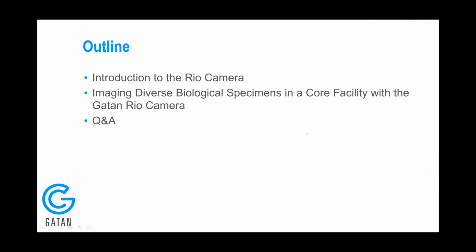Here is the outline for our webinar today. First, I will give you an introduction to the Rio camera, our newest CMOS camera from Gatan. Then our invited speaker, Dr. Daniel Yergin, will tell us how they use this camera in their core facility for imaging biological specimens. And after her presentation, we will have a few minutes to answer some of your questions.